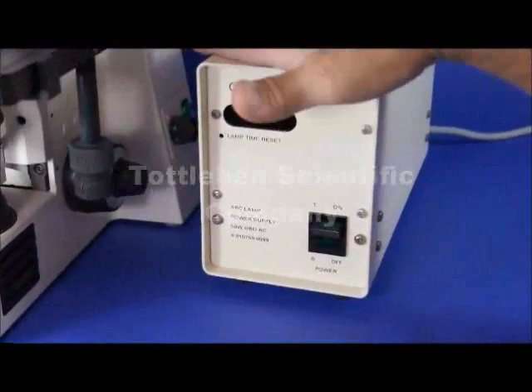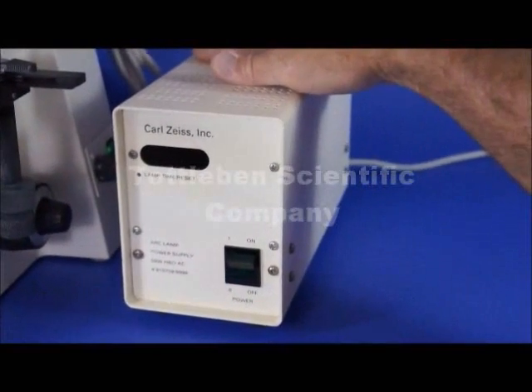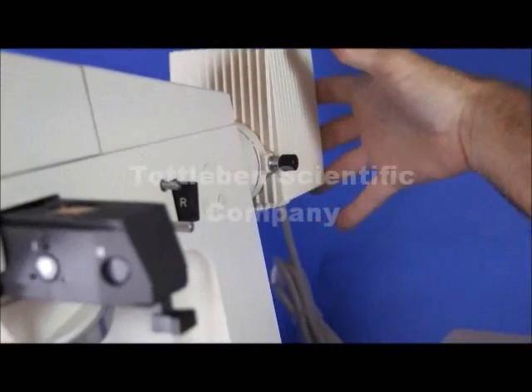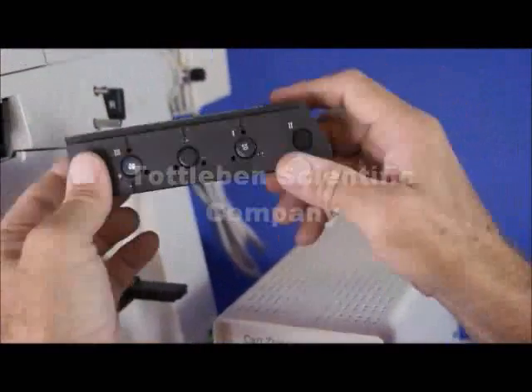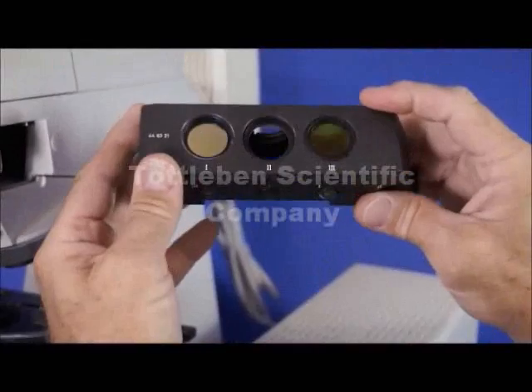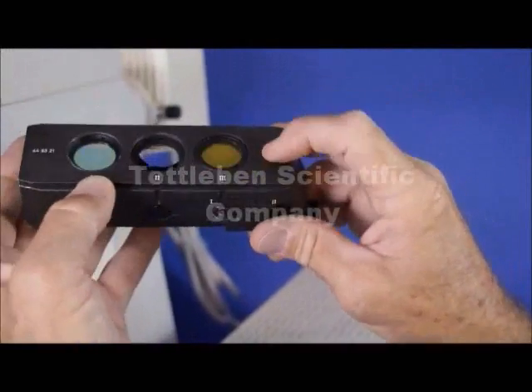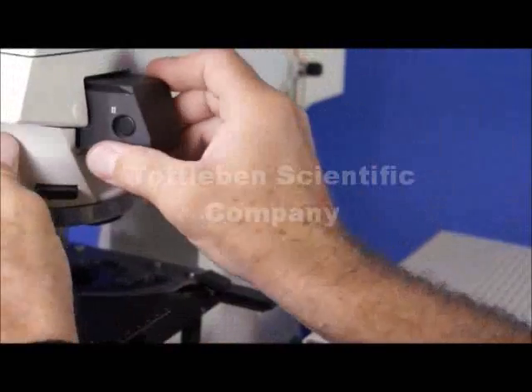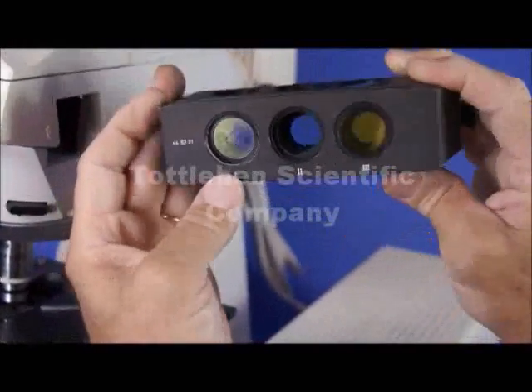Moving over to the right side you can see the fluorescence unit — it's a 50-watt HBO power supply and it works in conjunction with the 50-watt mercury lamp housing at the back. Moving to the front, there is a set of epifluorescence filter cubes. These are set up for DAPI, which is for low UV fluorescence, and FITC, which is fluorescein isothiocyanate. The middle position is for viewing in brightfield when you're not doing fluorescence, which is very useful.